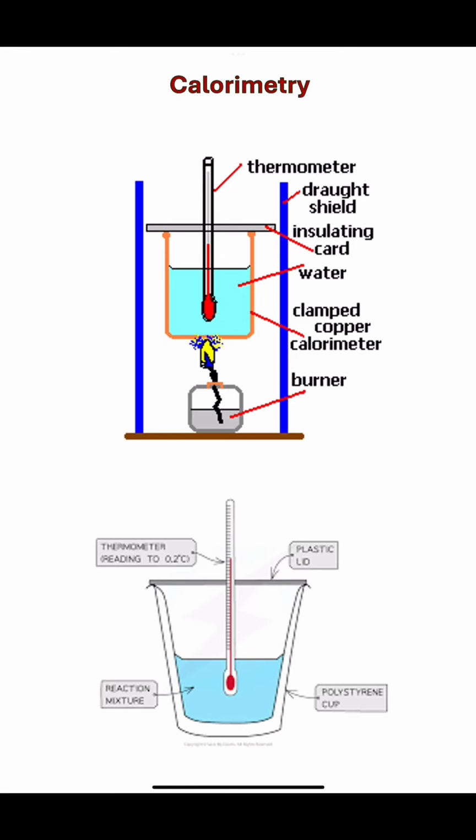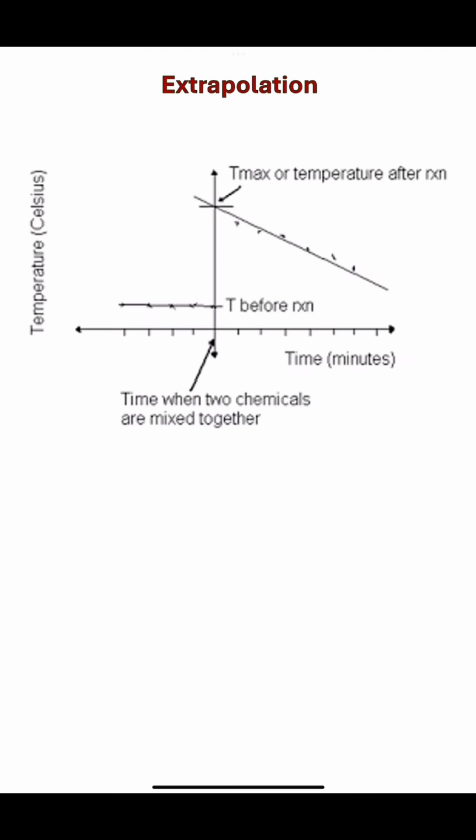If you are doing the experiment to calculate the enthalpy change of solution, then in this case you use a polystyrene cup because it has good insulation. You add a certain volume of water in the same way, measure the temperature for 4 consecutive minutes, and then open the lid and add your solid that is going to dissolve in water. You add it rapidly in one portion. You don't add it portion-wise. Then you measure the temperature change every 1 minute.